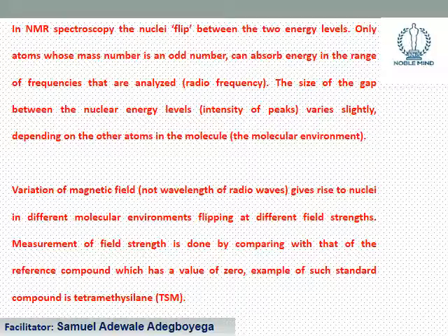They flip at different field strength, and when you measure the field strength, you could do that by comparing it with the reference compound, which has a value of 0. An example of such reference compound is tetramethylsilane, TMS.